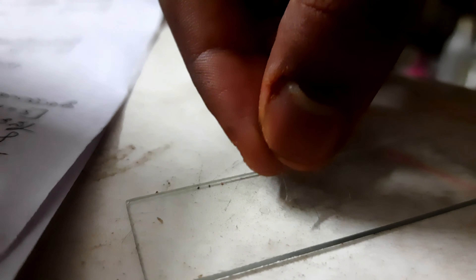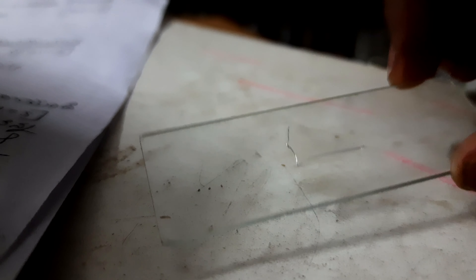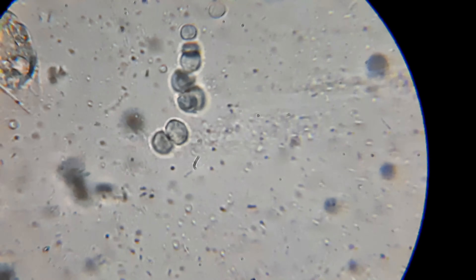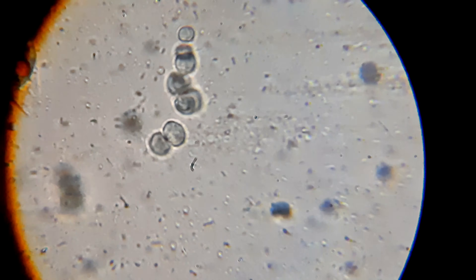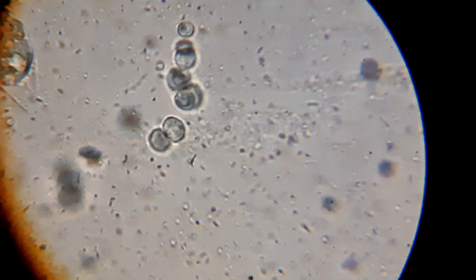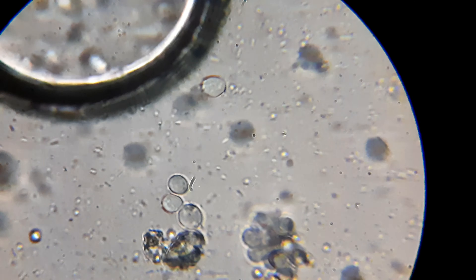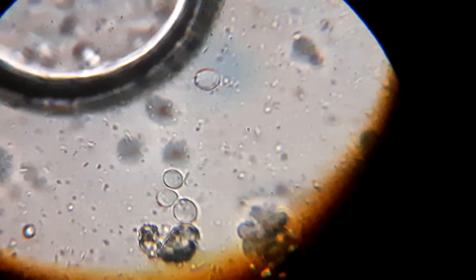I'm just shaking it around for a moment because the spores coagulate a little, so I just want to get them separated. The globular structures you can view in the microscope are nothing but the spores — these are the spores of a mushroom named Callocybe indica, which is an Indian mushroom rich in protein and carbohydrates.